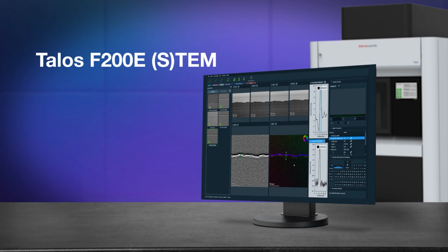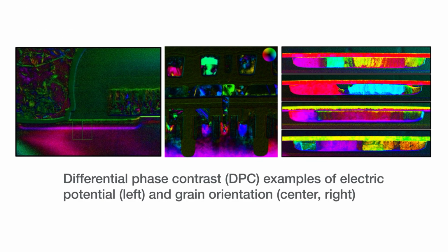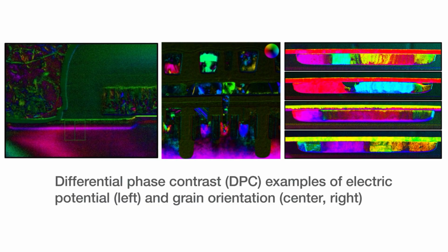It's easy to acquire these advanced datasets thanks to Thermo Scientific Velox software, a user interface unified across many workflows. In our first example, using the Panther STEM segmented detector, we show how to easily acquire and analyze iDPC images with the Talos F200E STEM.